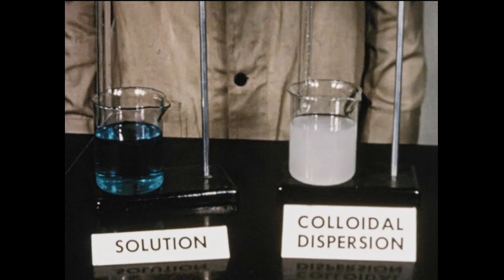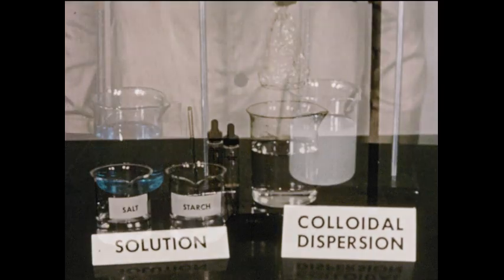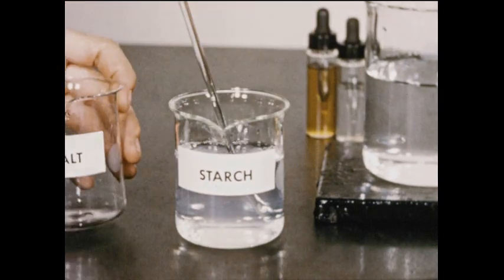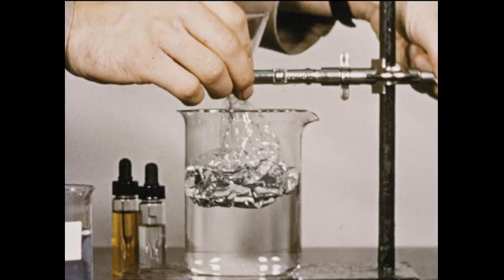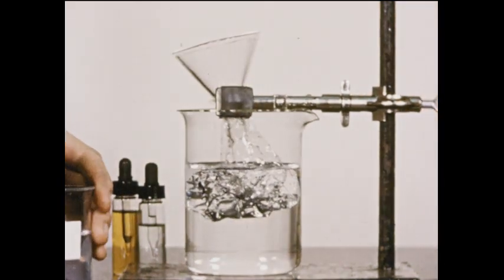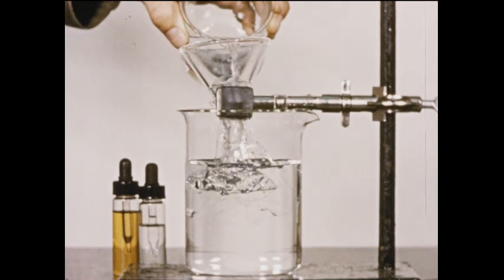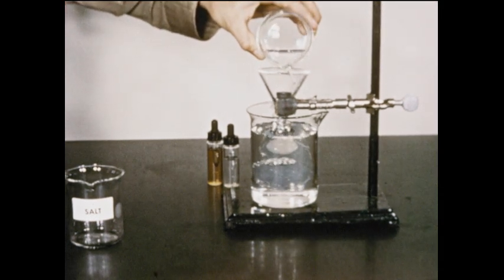Are colloidal particles, then, as small as the molecular particles of solutions? Perhaps we can answer the question with this experiment. Let's mix a salt solution and a colloidal dispersion of starch. We'll place the mixture in a bag made of a semi-permeable membrane. We suspend the bag in water. Then we pour in our mixture of a solution and a colloid. Next, we are going to test to see what passed through the membrane into the water.